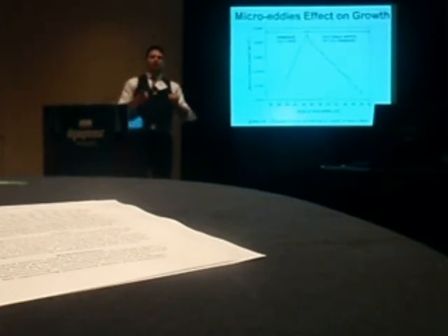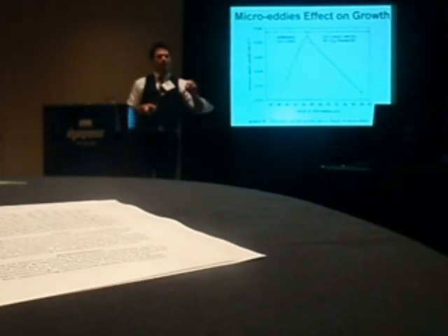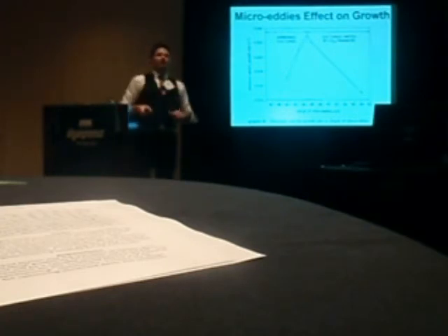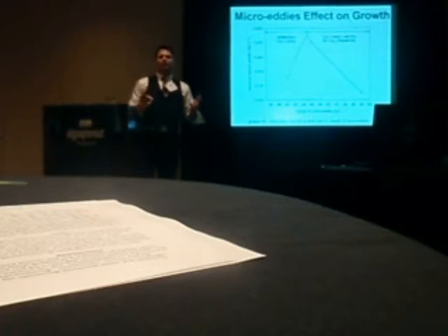Also, when these little bubbles cavitate, they create microeddies, and a specific size of microeddy. These are parameters we designed for, found through research. So this will require testing to validate.